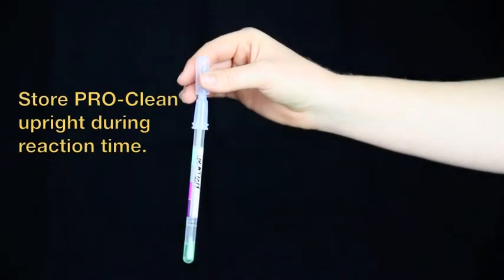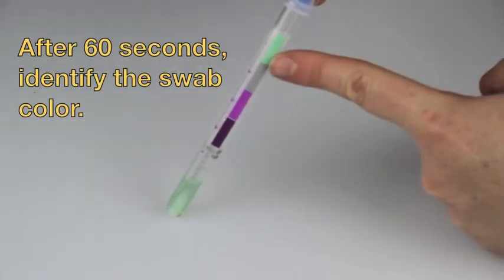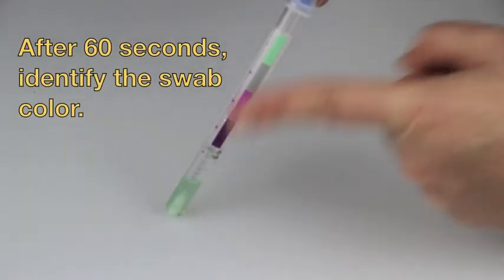Store ProClean upright during the reaction time. When time is complete, compare the color of the liquid against the color chart on the ProClean label.